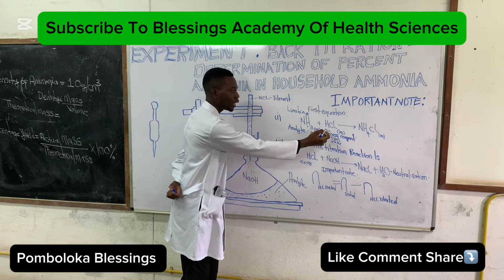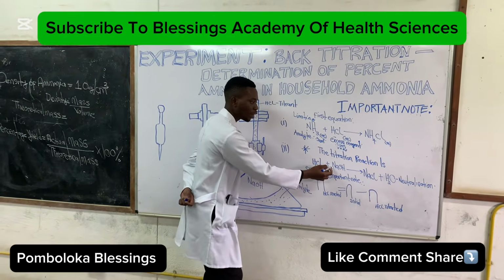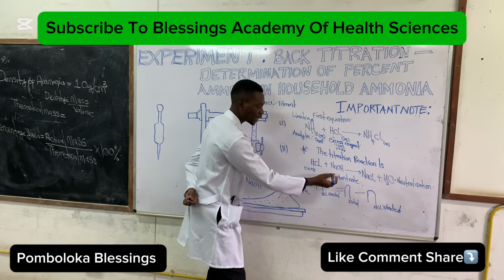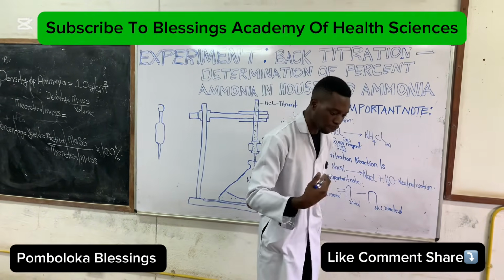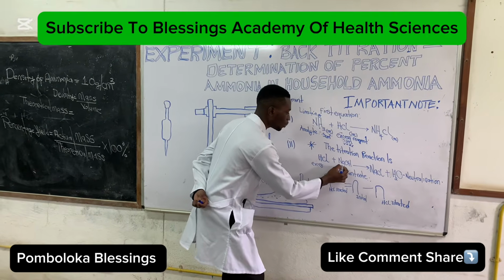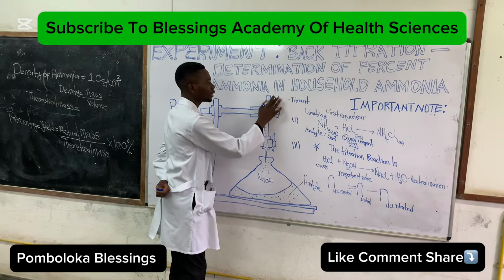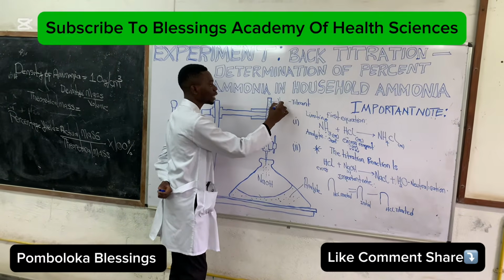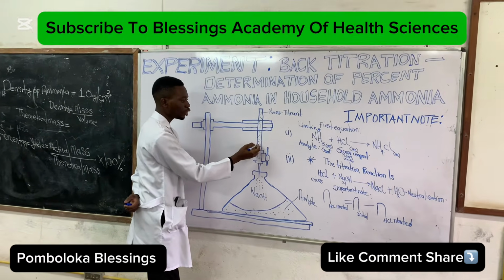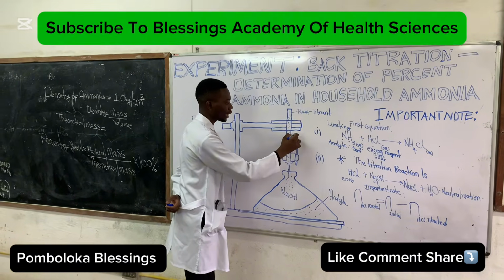The HCl that is still present is going to react with a certain concentration of the sodium hydroxide, giving us a salt plus water. When you get back to your lab manual, you discover the concentration of the sodium hydroxide is 0.1. We're also going to know the volume, because the sodium hydroxide now becomes the major titrant. What you're going to have in your burette is the sodium hydroxide, which is the titrant, as indicated there.